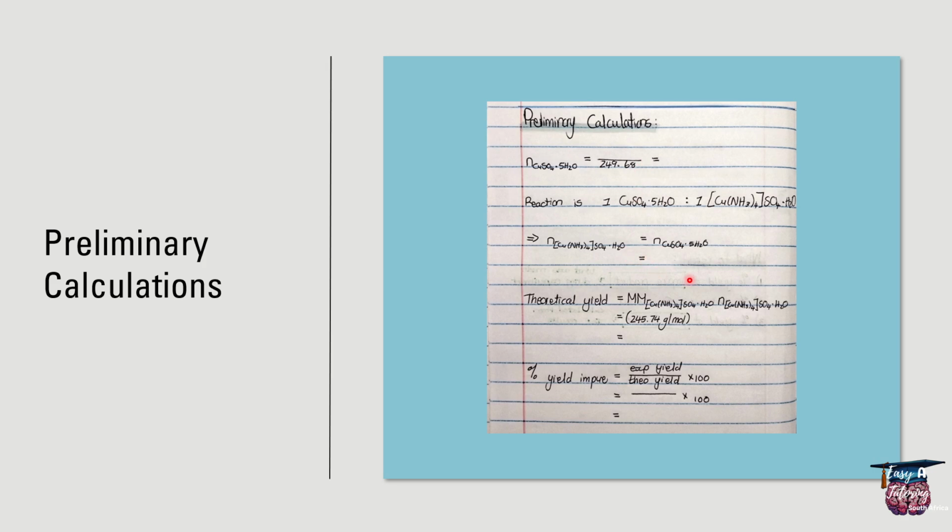Next thing is, once you're in the lab, if there is a step or a place where you wait a little time for something to happen with a reaction, you can then start doing calculations, for example your theoretical yield, because once you have what you weighed off, the moles that you need and for your final product, then you can already go and do these calculations.